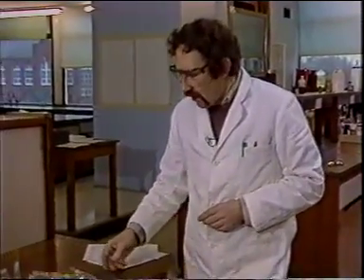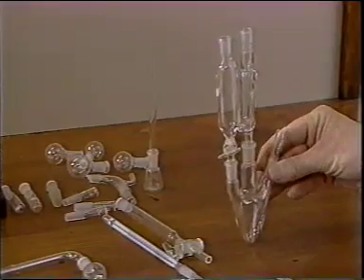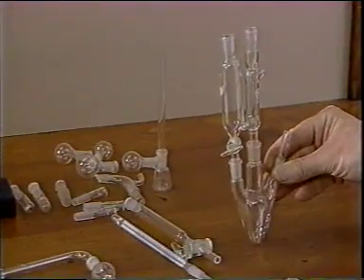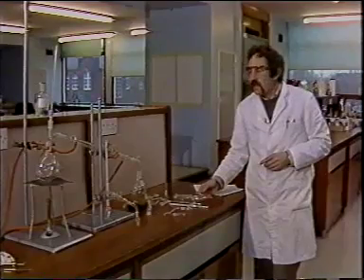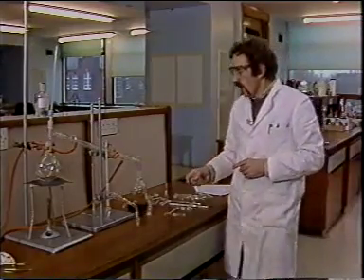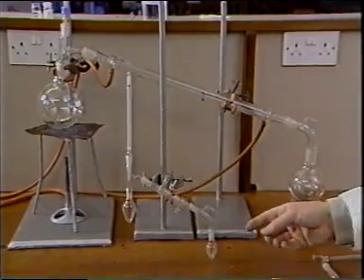An obvious way of reducing the scale is to reduce the size of the apparatus, and miniature apparatus of this type, called B10, is available just for this. A number of pieces are displayed here, but the best idea of the scale can be seen by comparing the normal distillation apparatus with its B10 equivalent.